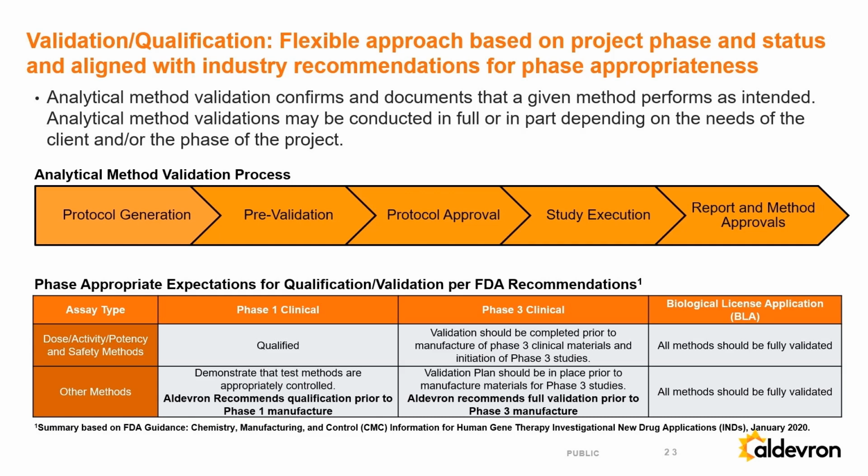The first stage is method development, knowledge gathering, developing, coming up with that analytical control strategy. This is where most of the robustness happens, and this is really the first step in the analytical procedure lifecycle. The second step is this qualification or validation piece that we'll talk more about in a second. That really is a snapshot in time. It is a confirmatory exercise, and so it typically is the shortest of the three stages in the analytical procedure lifecycle.